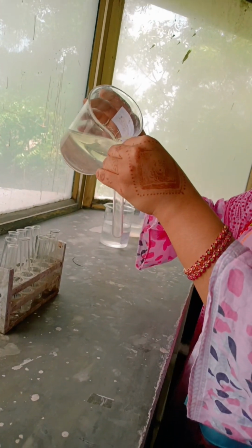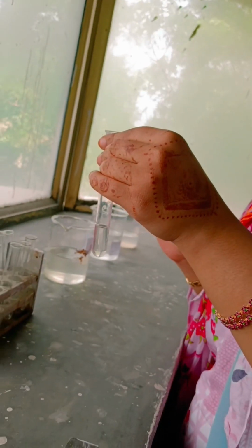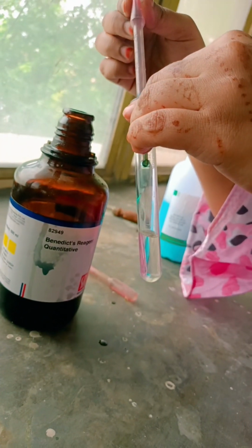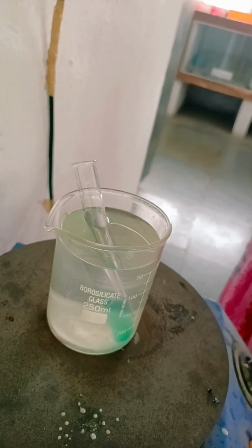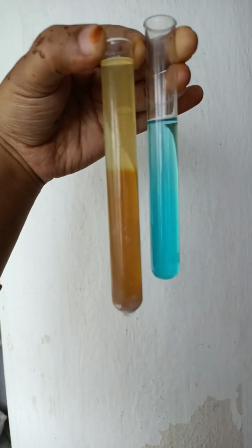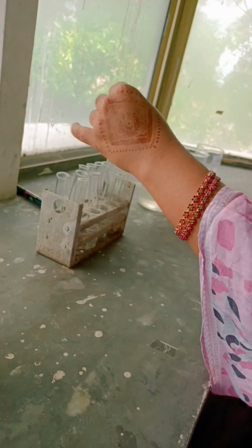Going ahead with the next test, that is the Benedict's test. Again, you take the sample and add a few drops of Benedict's reagent to it. It contains cupric ions. When you have added this and keep it for boiling, the cupric ions will be turning into cuprous oxide, changing the color to yellow, green or orange red. As you can see, depending upon the intensity of the reducing sugars, the color changes.